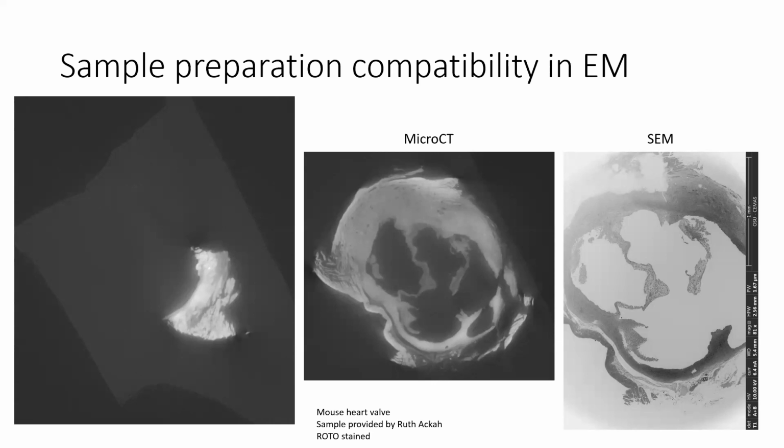How do people prepare, like, if they run a metal or grain, how do they prepare this? They just bring it. A lot of people just bring a piece of metal. Yeah, it has to be mounted on a post, so we'll super glue it to something or stick it in some foam on a post, but there's nothing that needs to be done in particular.